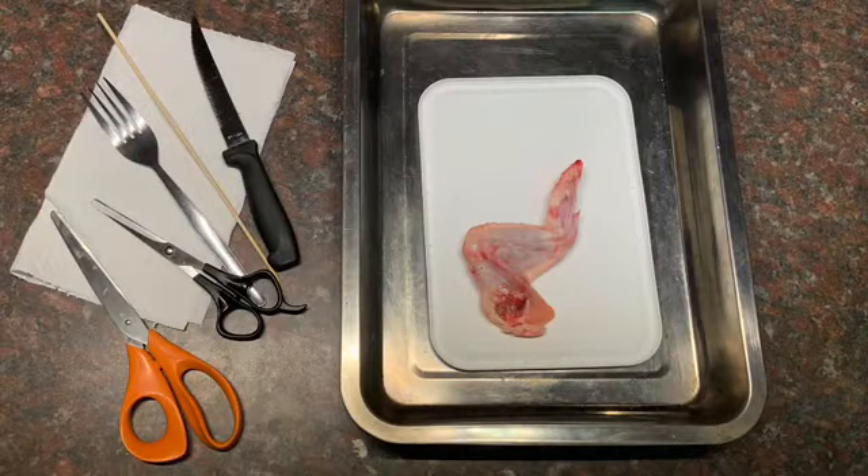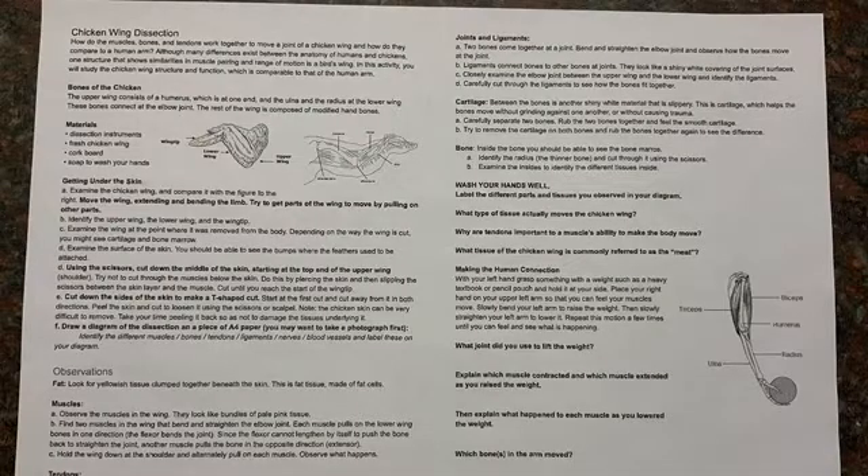You're going to need a raw chicken wing and some cutting tools like a pair of scissors, a very sharp knife, and then something to pick out things with like a skewer. Don't forget your worksheet, which also has the questions on it that you need to answer.